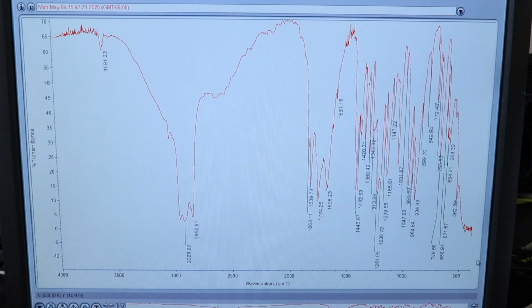And there it is. There is definitely some diacid contamination in there. We can see the carboxylic acid funnel and an additional carbonyl peak around 1698 it looks like. But we do see the two carbonyl peaks for the anhydride around 1840 and 1774. And that, along with the melting point, does indicate that the product was produced and was the major component of the crystals isolated.